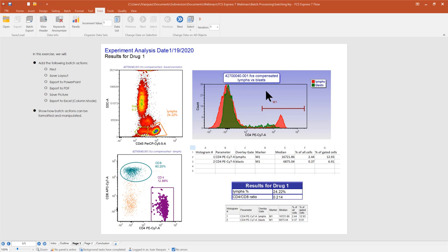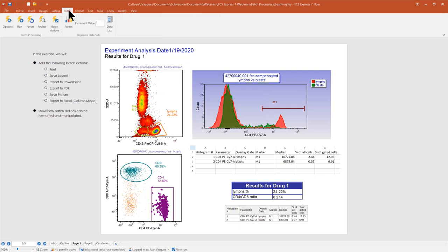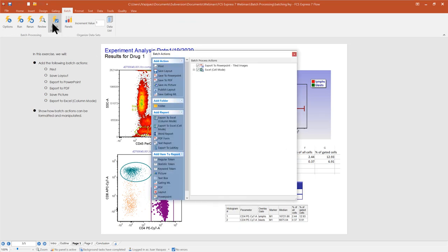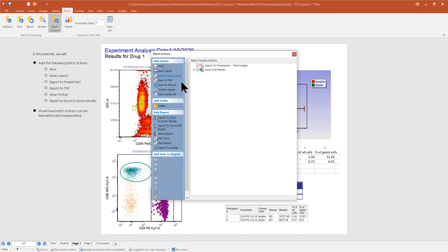In this exercise, we're going to show you how to add batch actions to our layout. From the Batch tab, you'll see a tool for Batch Actions. If we click on that, we open the Batch Actions window. I already have two batch actions in here, but we're going to talk about how we can add these actions and format them so FCS Express will produce my data in any selected format.